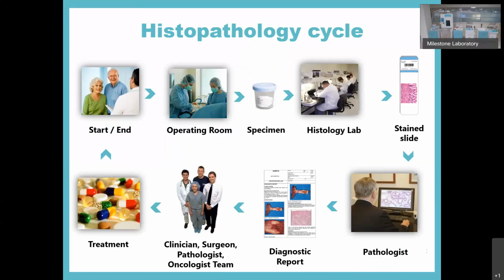I want to start, first of all, with this slide that is the histopathology cycle, where you can see that everything starts and ends with the patient. Why do I want to start with this slide? Because we must remember that the moment the specimen leaves the patient's body, the diagnostic path and therefore the treatment starts. So today in this webinar, ultimately, we are talking about delivering to the patient the best possible treatment.